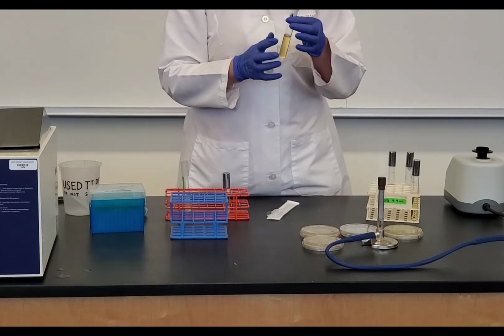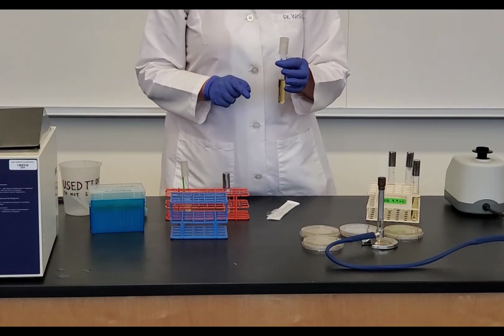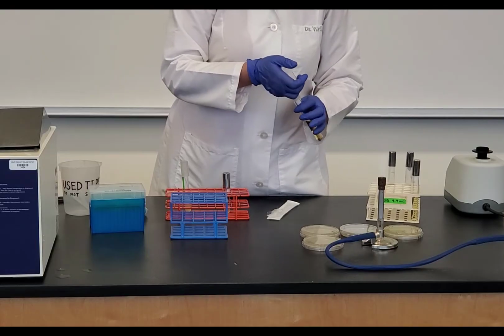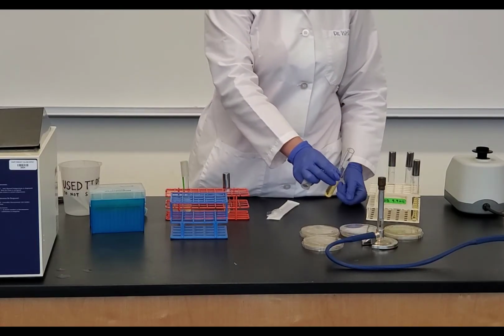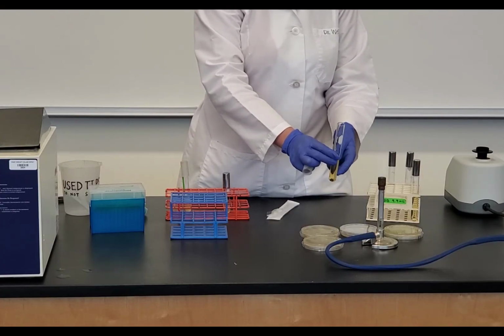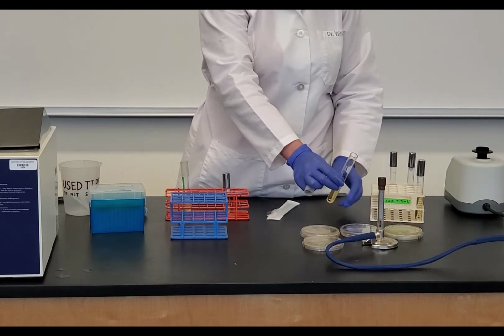So I have my melted agar deep. It has my virus, it has my bacteria. Now it's ready to be poured. When I do this, I like to flame the opening of the tube, and let it cool a little bit because I don't want the bacteria and virus in my melted agar deep to touch that hot rim of the tube.